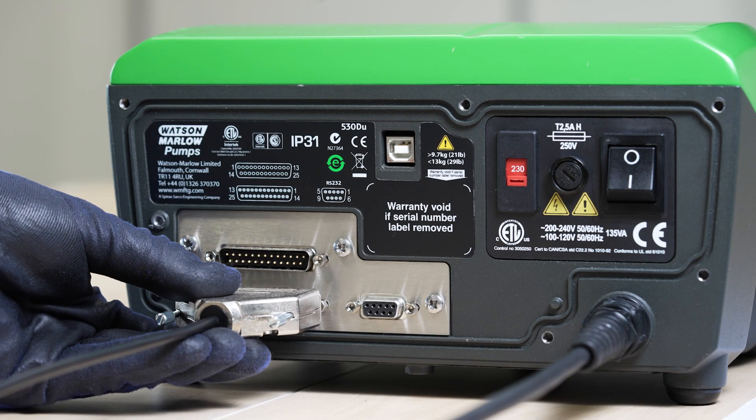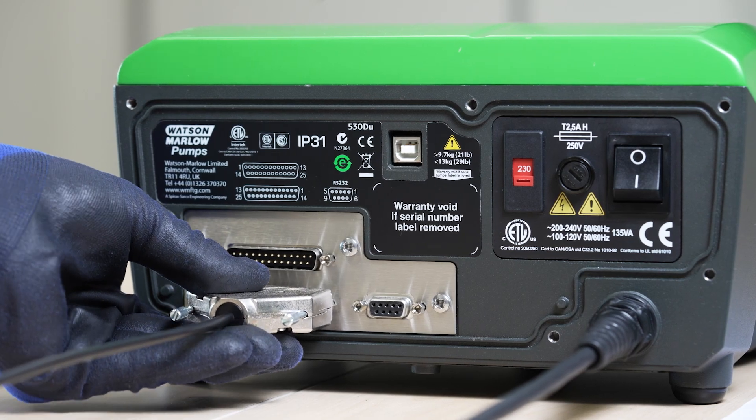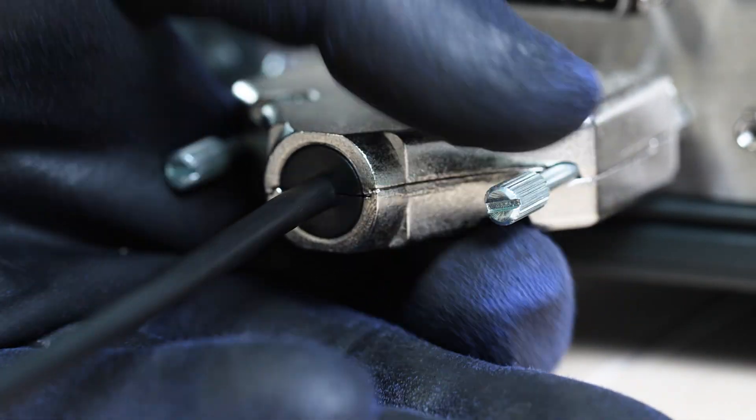With the pump off, ensure your process signal is connected and within range. Turn the pump on.